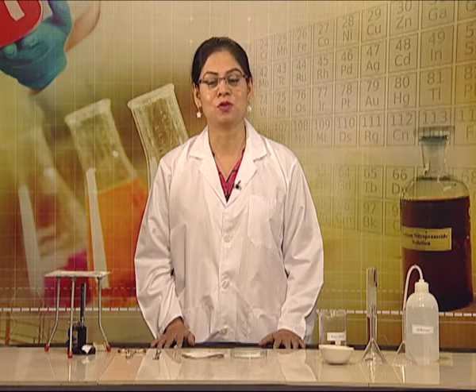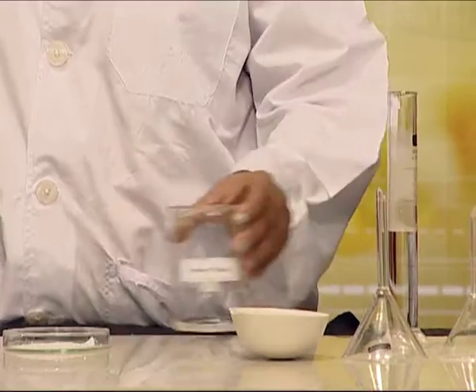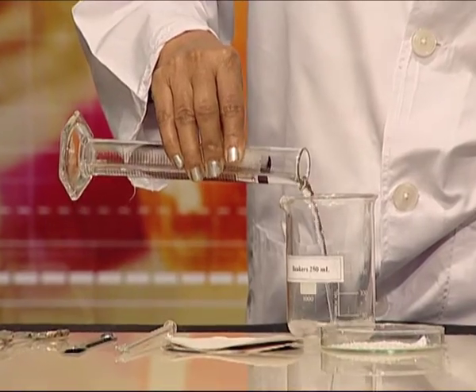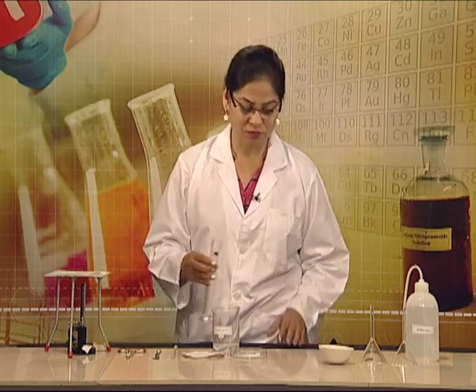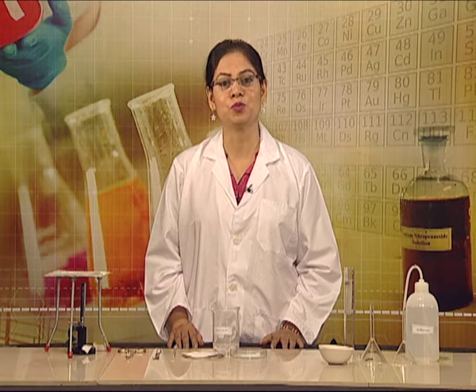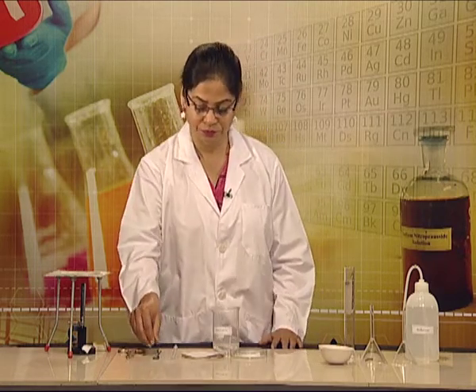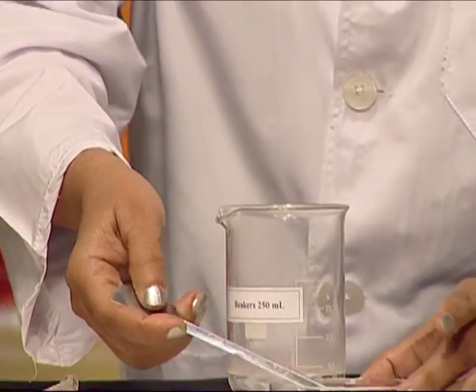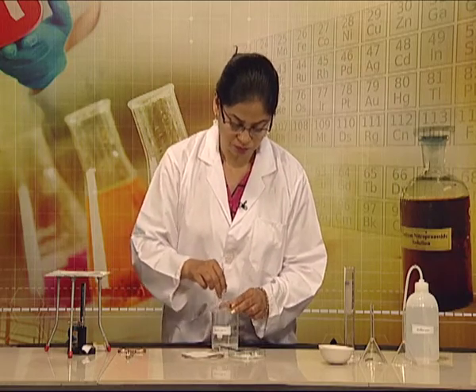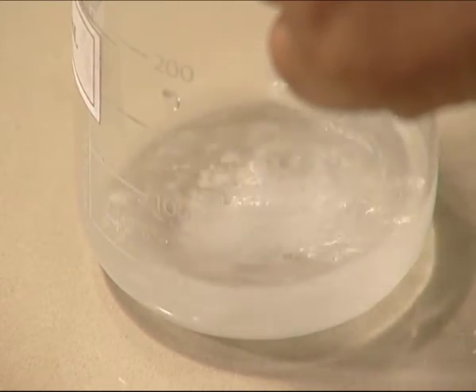Now, we will start the process of preparing the solution. Let us take 30 ml of distilled water in a beaker, and prepare a saturated solution of the benzoic acid sample at room temperature by adding a small amount of benzoic acid sample with constant stirring. Stop adding the sample when it does not dissolve further.